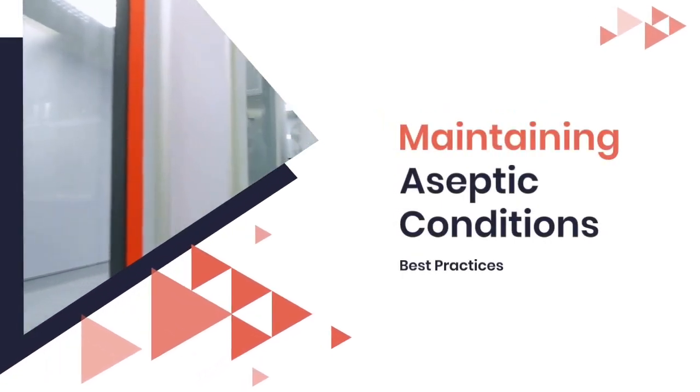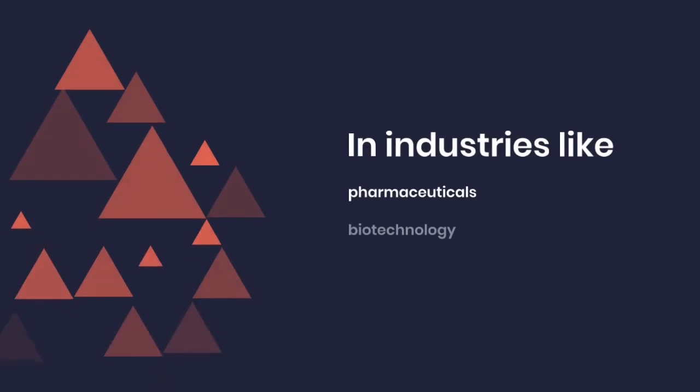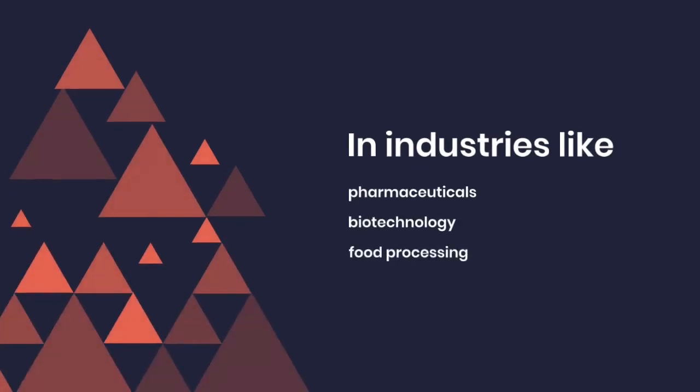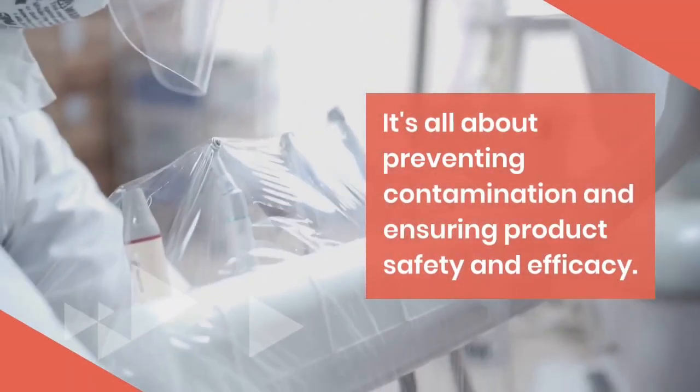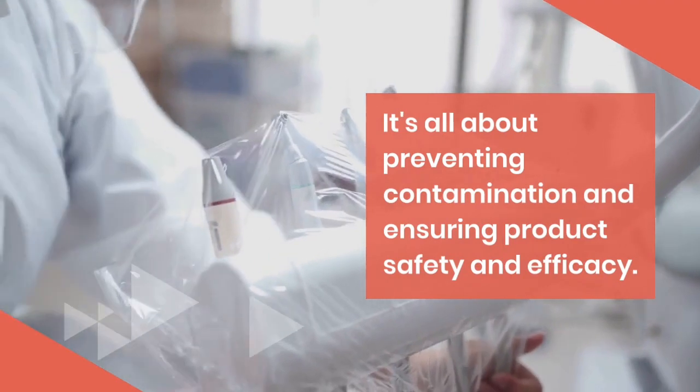prevent contamination and ensure the safety and efficacy of products, particularly in industries such as pharmaceuticals, biotechnology, and food processing. Here are some methods and principles commonly employed to maintain aseptic conditions.